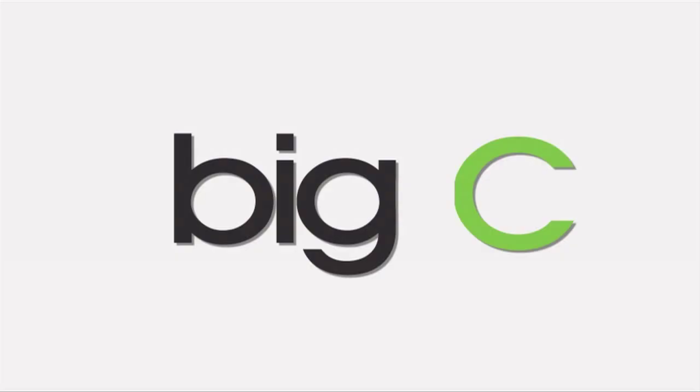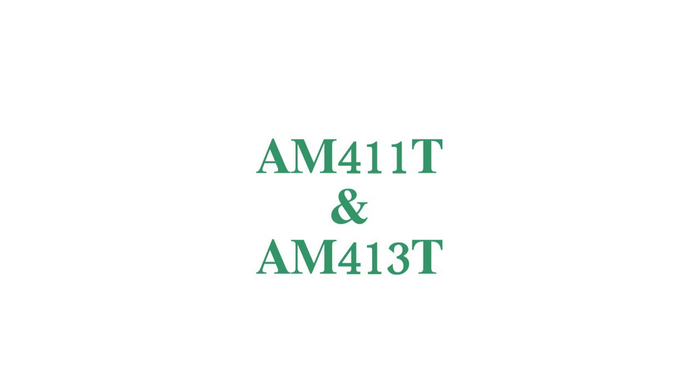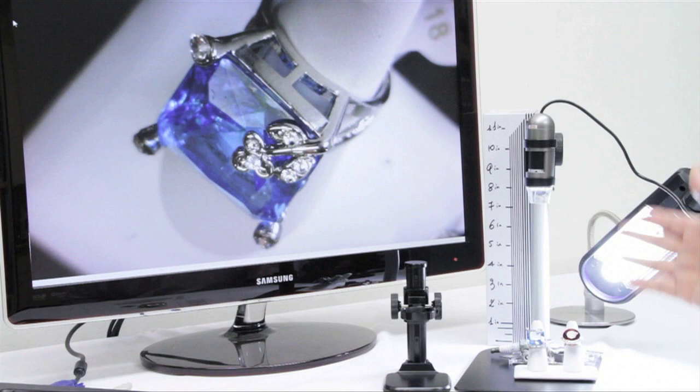Introducing the AM411T and the AM413T. The only difference between these two scopes is one has a measurement feature and one does not. The AM413 has the measurement feature.